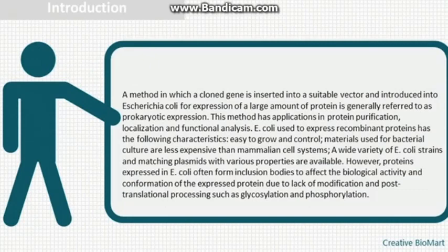Introduction. A method in which a cloned gene is inserted into a suitable vector and introduced into Escherichia coli for expression of a large amount of protein is generally referred to as prokaryotic expression. This method has applications in protein purification, localization and functional analysis.